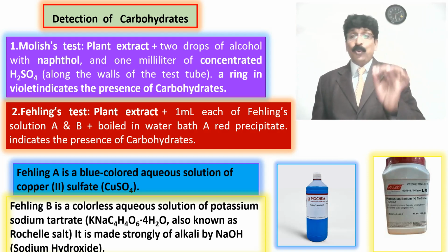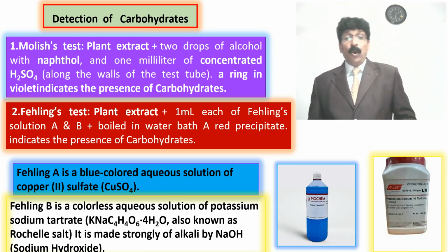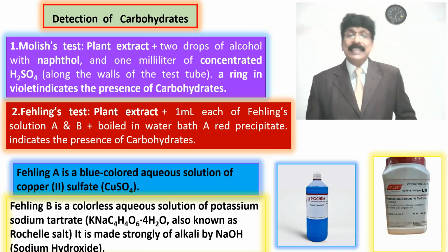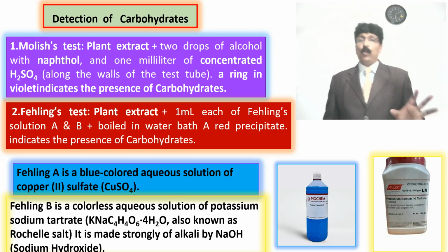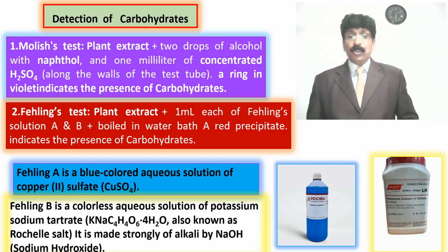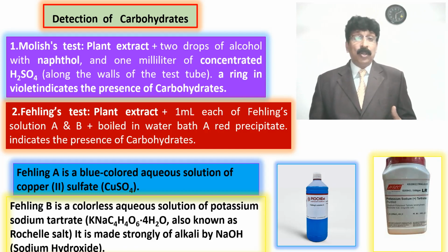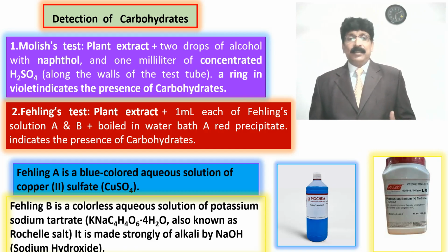Potassium sodium tartrate, that is KNaC4H4O6, and 4 water molecules is present in that molecule. It is also known as Rochelle salt. That is called the potassium sodium tartrate.